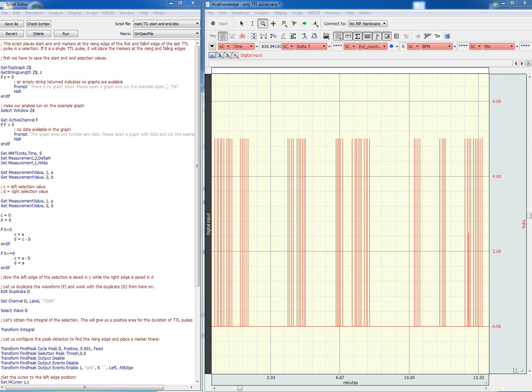The current script allows you to mark the beginning and end of a series of TTL pulses. This can be useful for marking the beginning and end of an experimental condition which has been marked with all the digital pulses, as can be seen here on the screen.